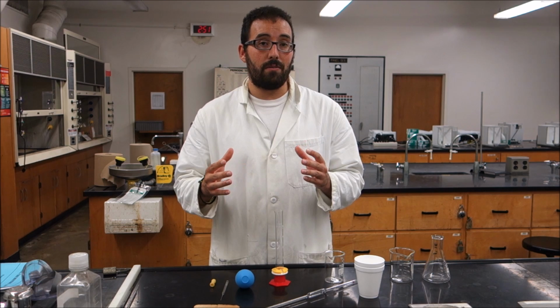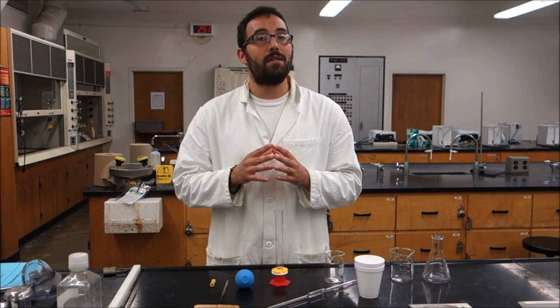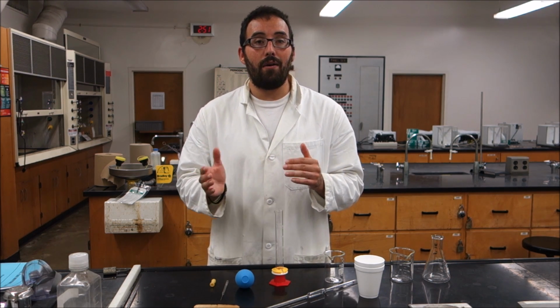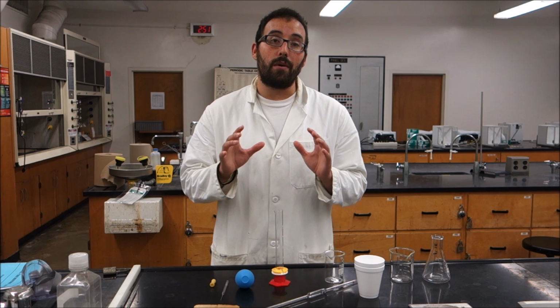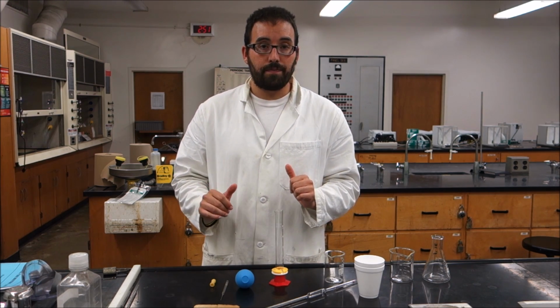Other things to think about when it comes to measurements are the transfer vessels themselves. What are going to be your best ways of transferring things in and out of vessels? We want to minimize the heat loss and the error in our experiment. So think about those things when you're designing your experiment.